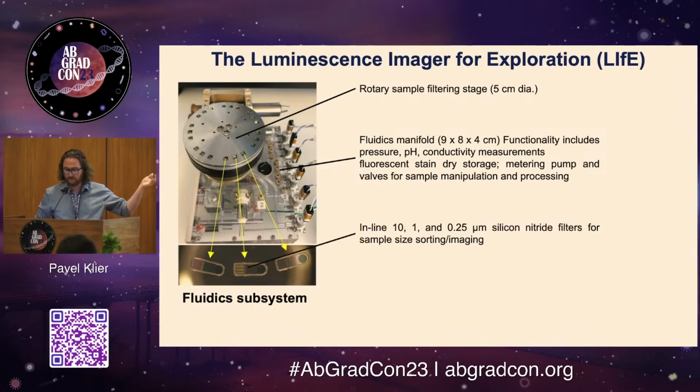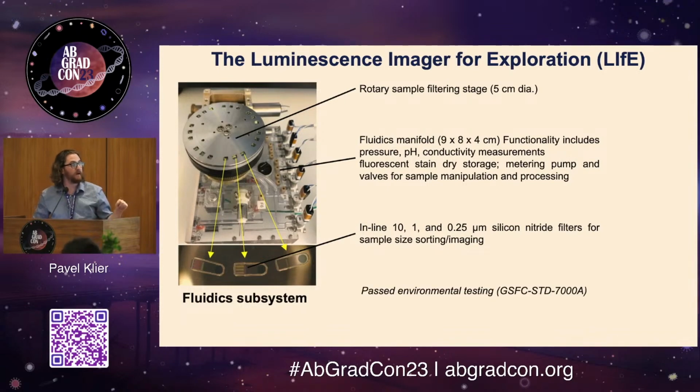These were the filters that I mentioned earlier. Again, this is for sample size sorting, but they're also made of a silicon nitride substrate that has a low fluorescence background. And this whole system has passed environmental testing.